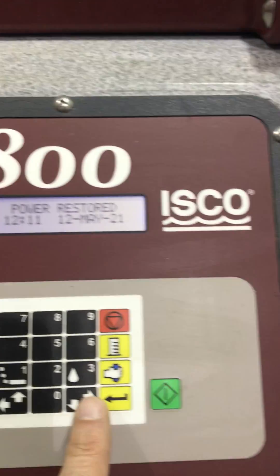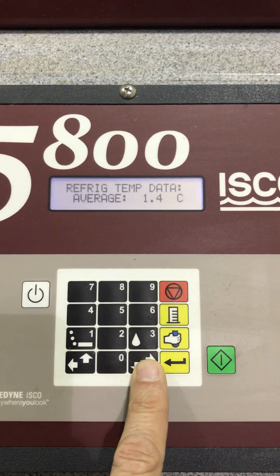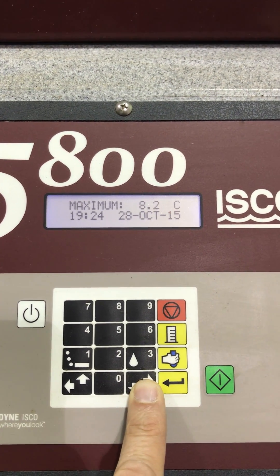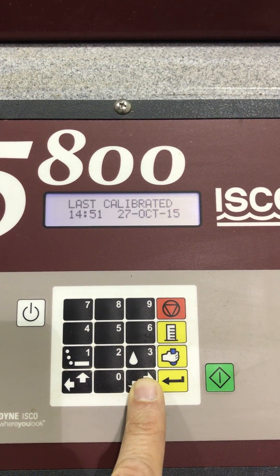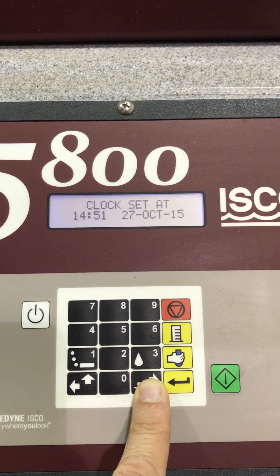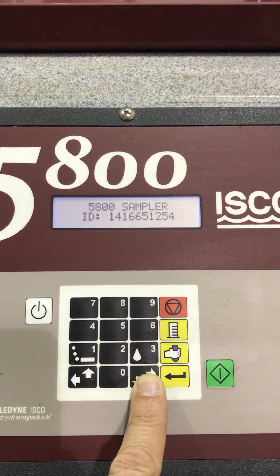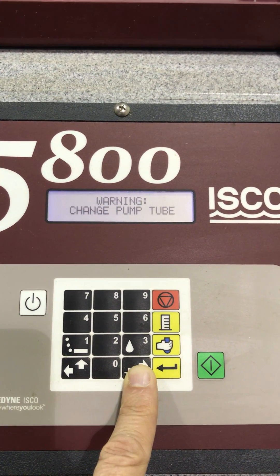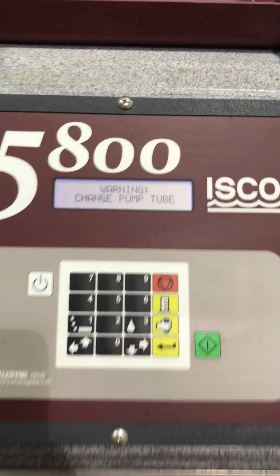I cycle through some of the settings here. You can do temp data — minimum, maximum, as calibrated, as programmed. Box set. Sampler ID. Hardware. Approxions none. Change pump.